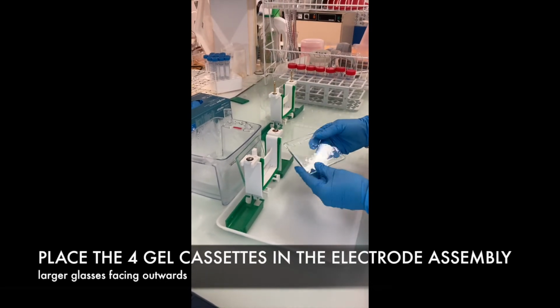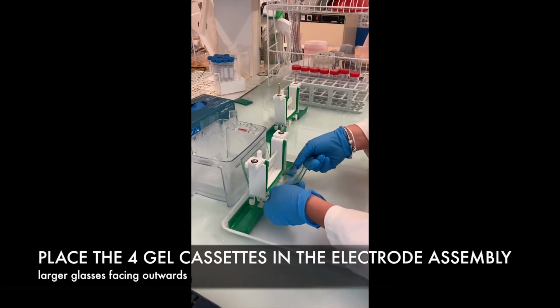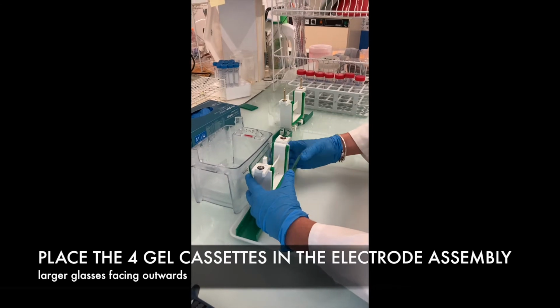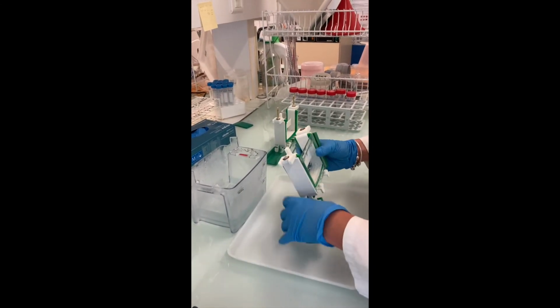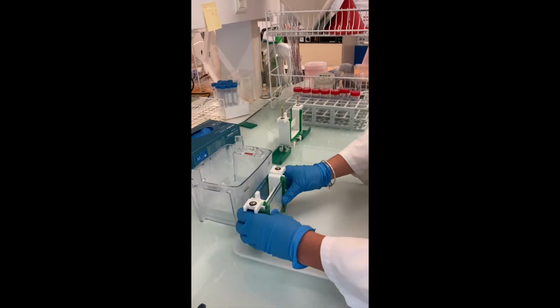First, place the cassettes containing the gels on the electrode assembly, with the large glass plates facing outwards. Each electrode assembly can contain 2 gels.